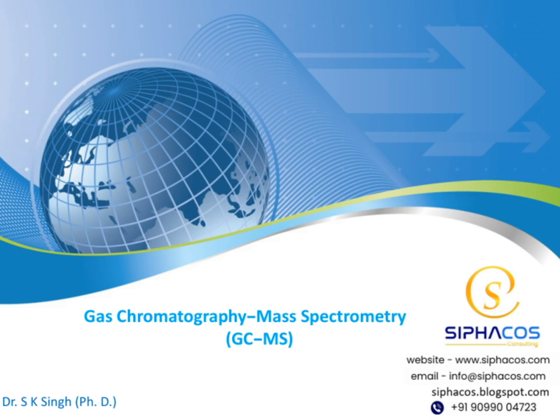Today, we'll be exploring gas chromatography, mass spectrometry, or GC-MS for short. Over the next few minutes, I'll guide you through what GC-MS is, how it works, and its important applications. I'm excited to share this knowledge with you, so let's get started.